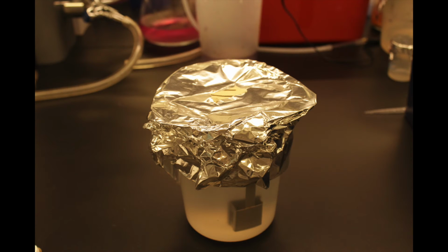Lastly, put a piece of autoclave tape onto the tinfoil in the container, and then take the container to be autoclaved on liquid cycle. Once the devices and cover slips come out of the autoclave, they are ready to be inoculated.